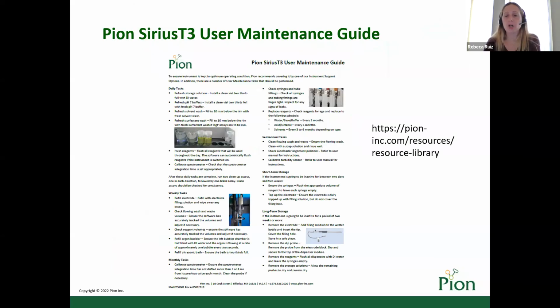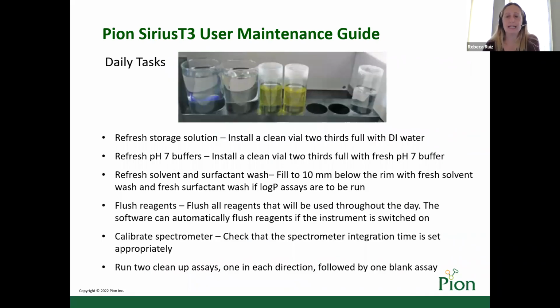So this application note can be found on our website in the resources library. It's a good guide which explains which tasks have to be done every day, every month, every 3 months, and every 6 months. So for example, for the tasks that need to be done daily.